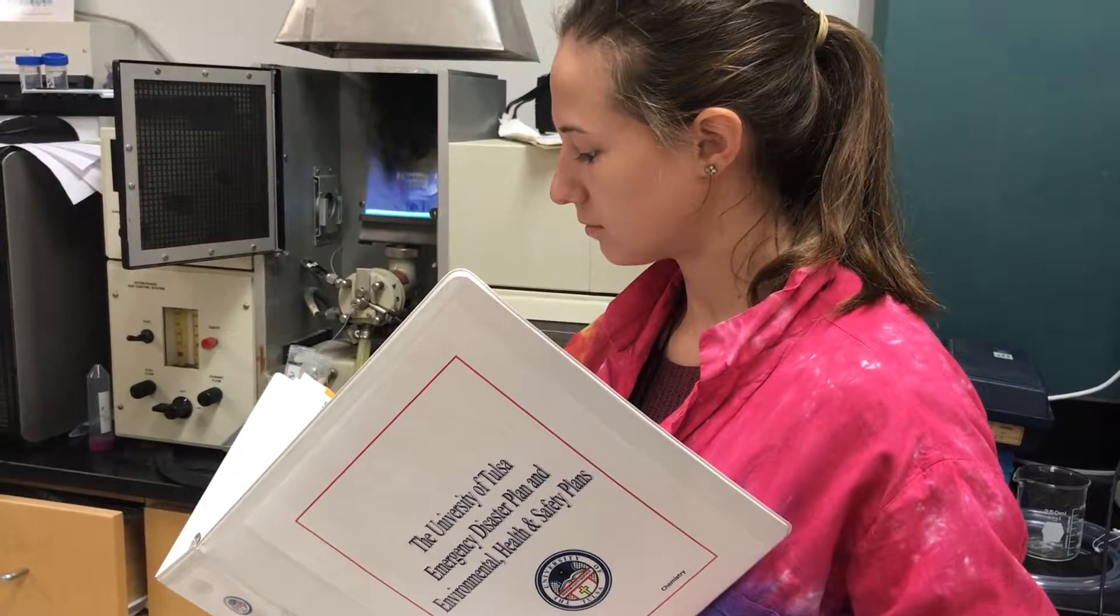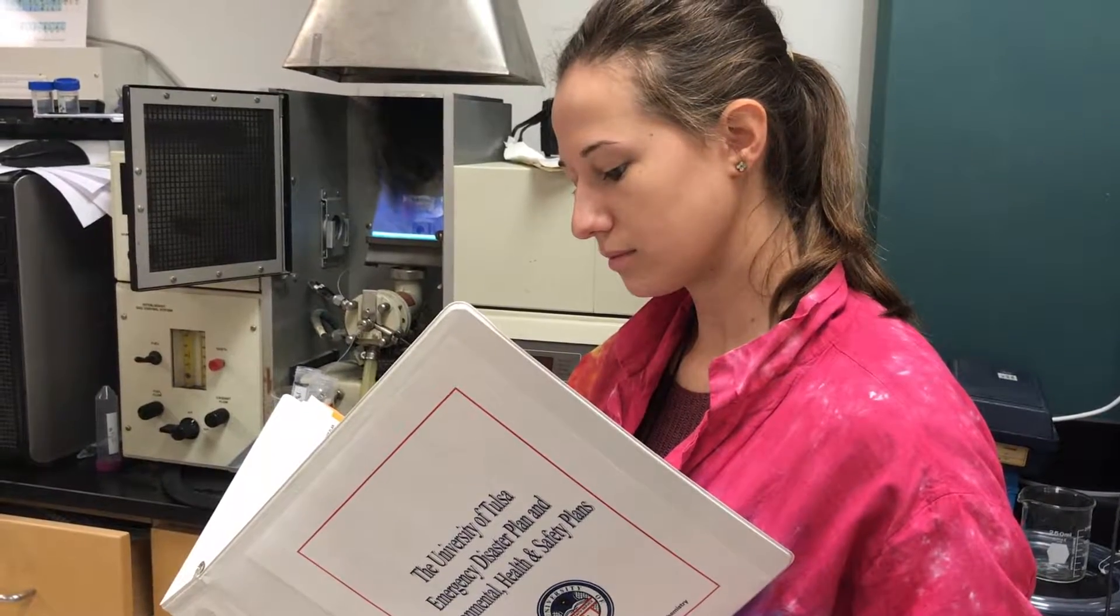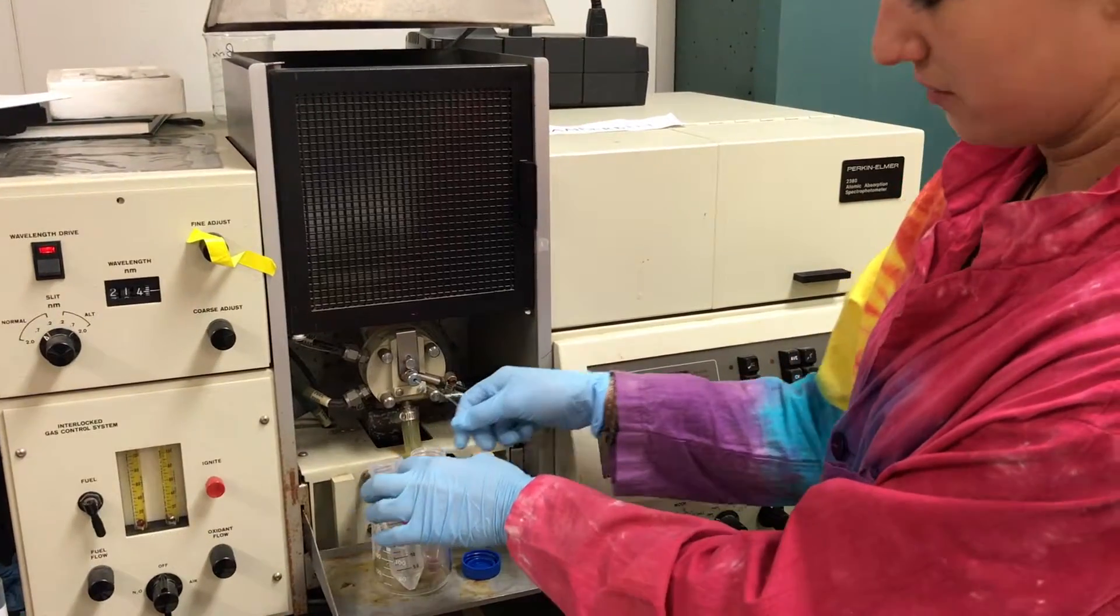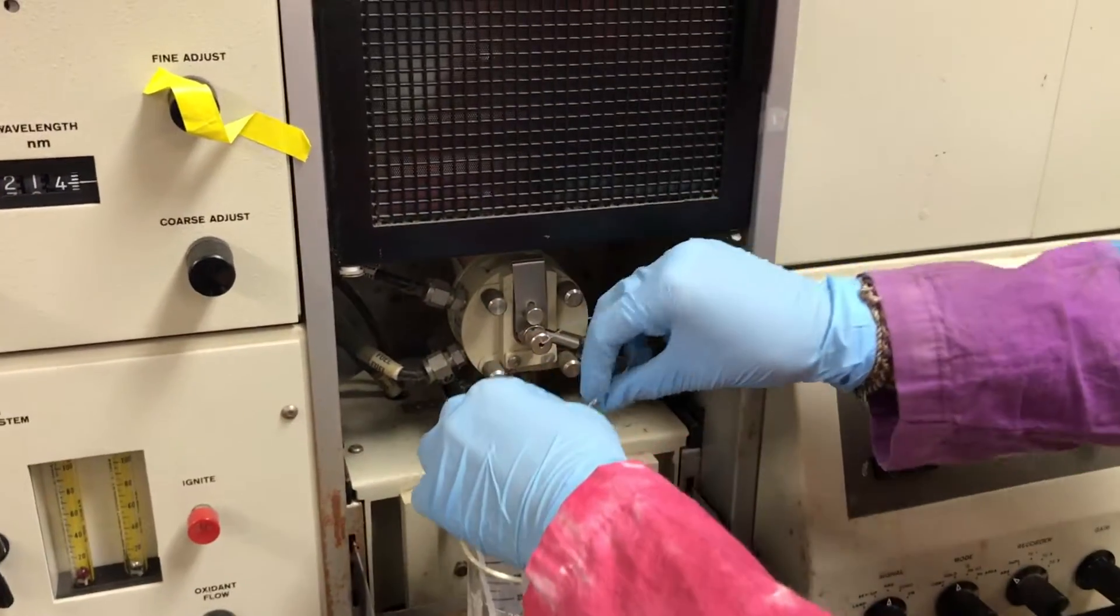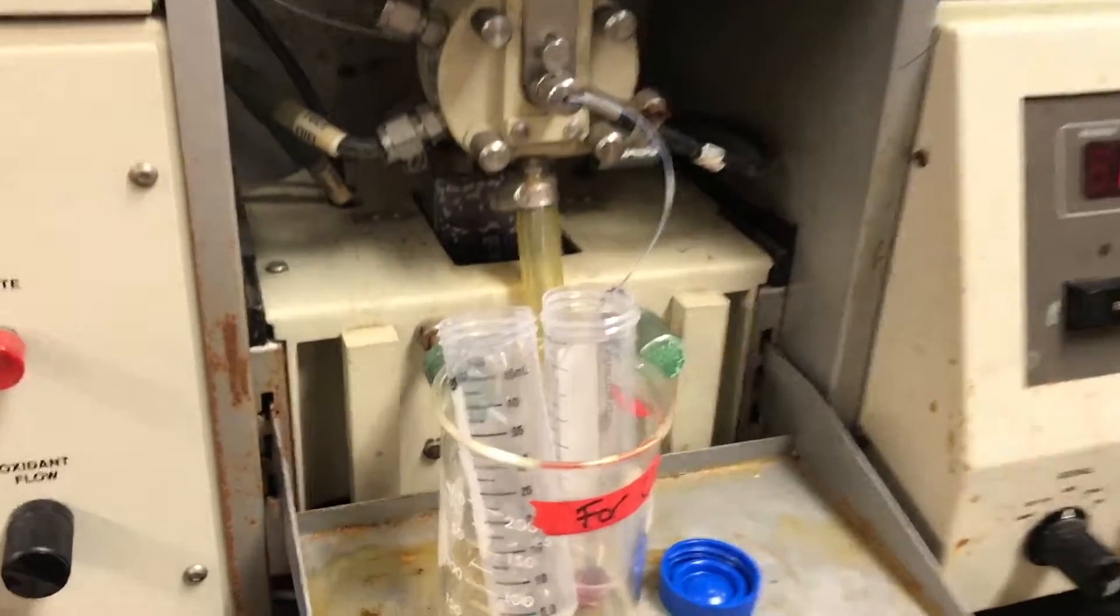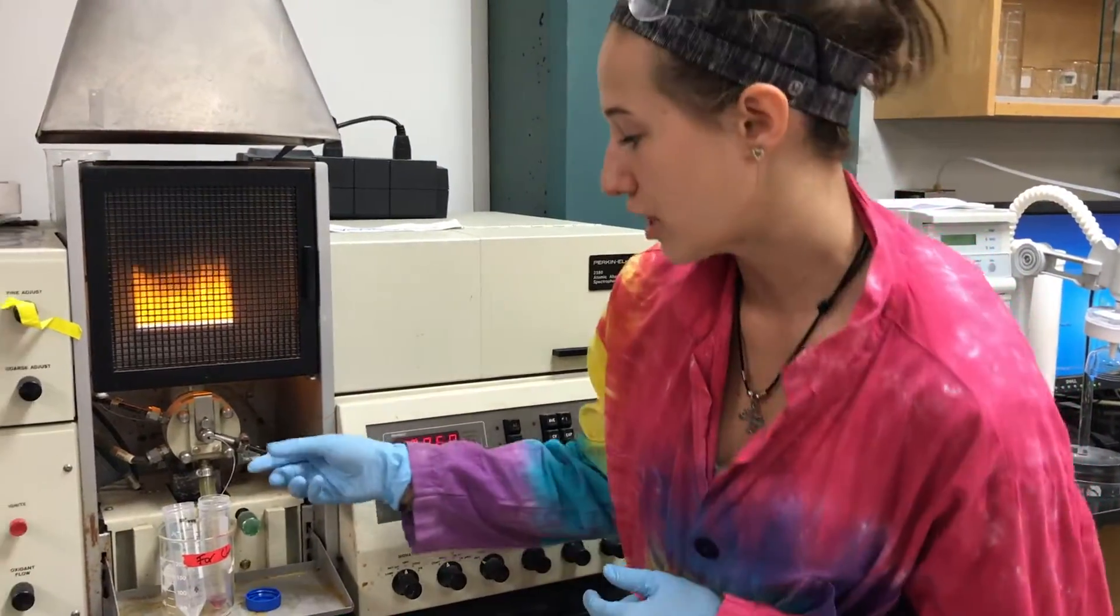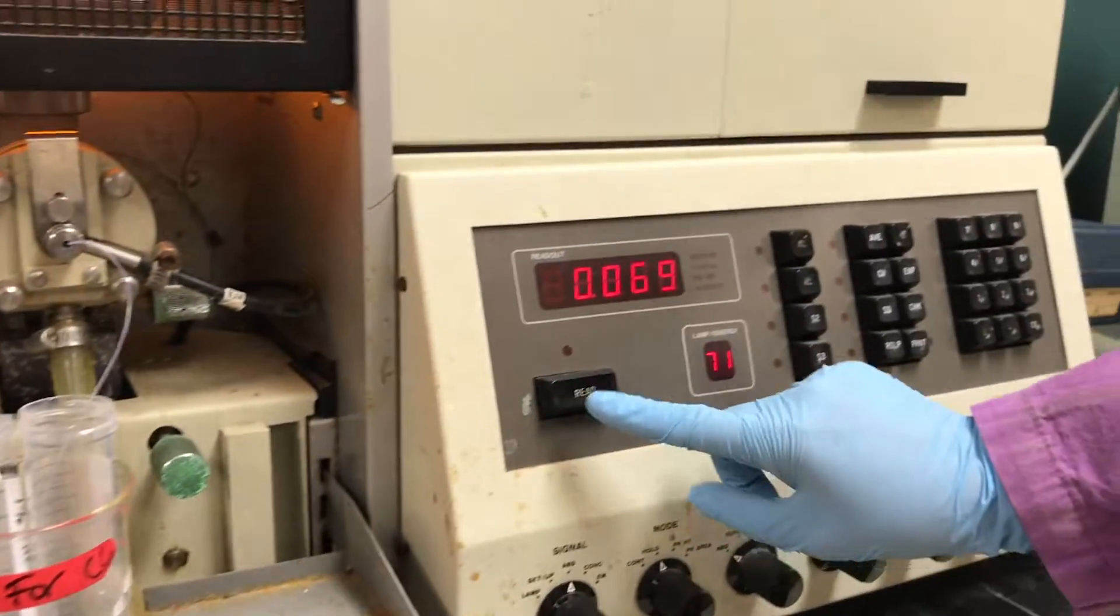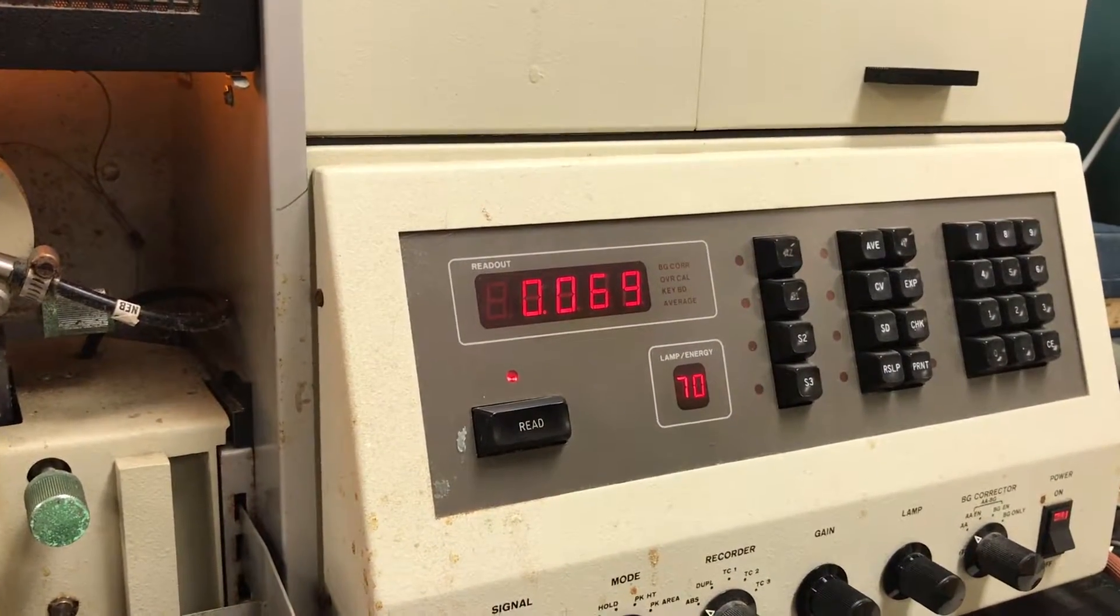Oh, the weather outside is frightful, but the fire is so delightful. Place it into the sample holder, a.k.a. beaker. Take the tube and slide it directly into your sample. The instrument is now sucking up our sample through this very tiny tube. To get a reading of absorbance, click read, and it will take an average over a five-second time frame.